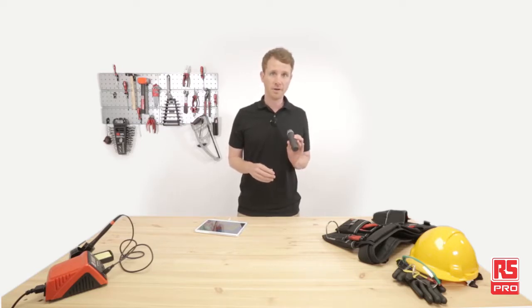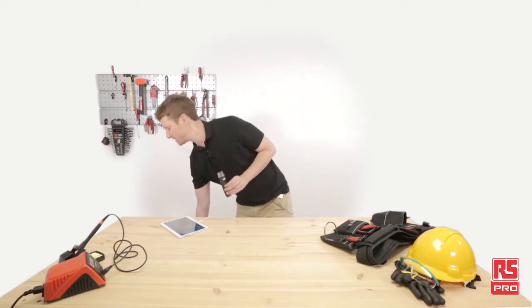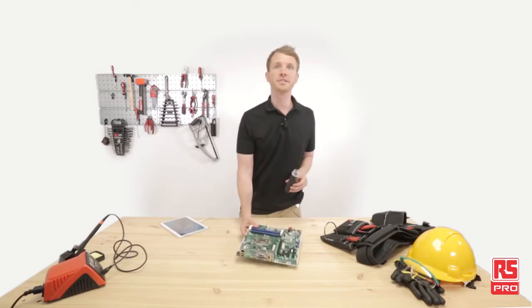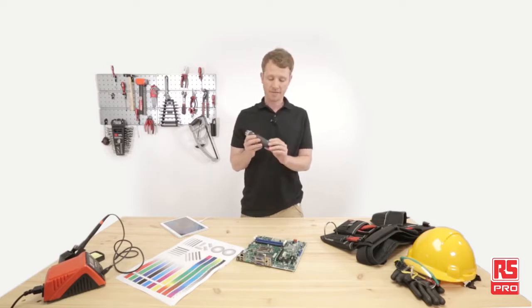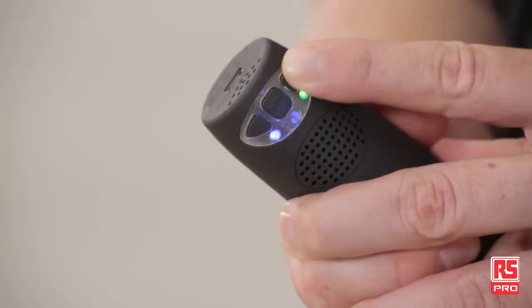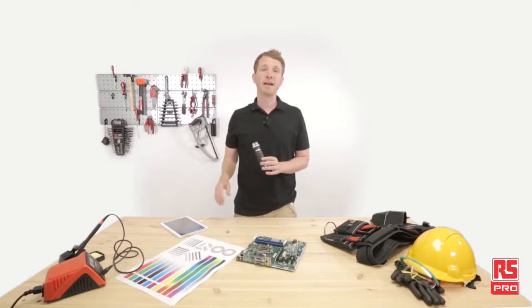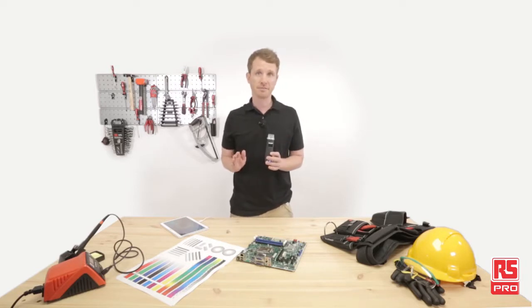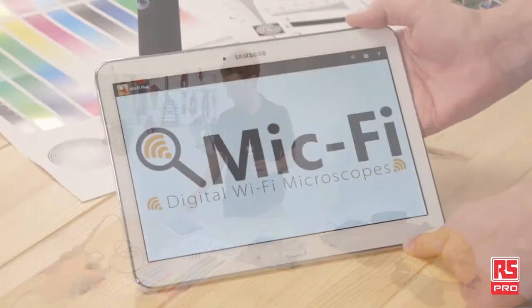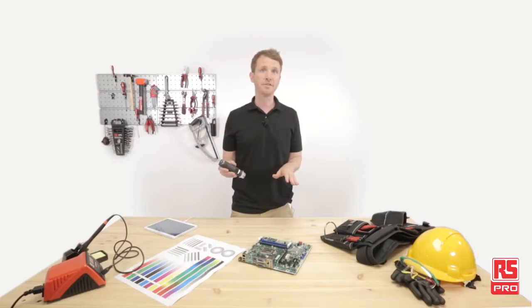The RS Pro MiFi can also output directly to the computer via the USB cable included in the pack. To do some tests with the RS Pro MiFi wireless microscope, I've prepared a few objects to check its capabilities and the additional functions of the MiFi app. Let's start by switching on the Wi-Fi transmission. The RS Pro MiFi becomes a hotspot generating a Wi-Fi signal of up to 5 meters. I've already downloaded the MiFi app onto my tablet, so I just need to connect to the MiFi wireless network and start receiving images immediately.